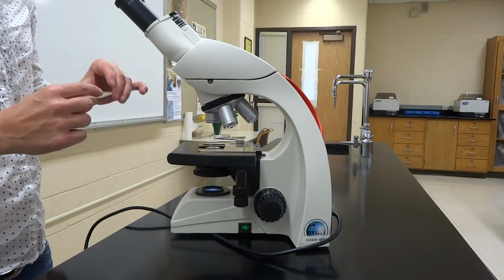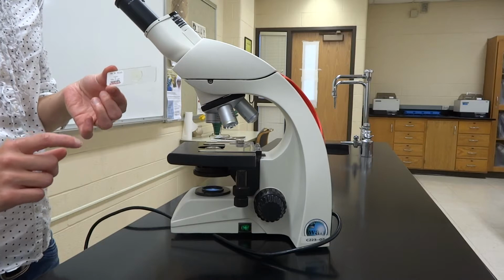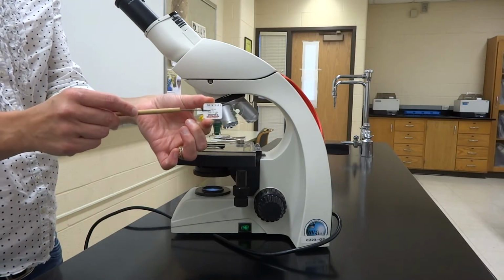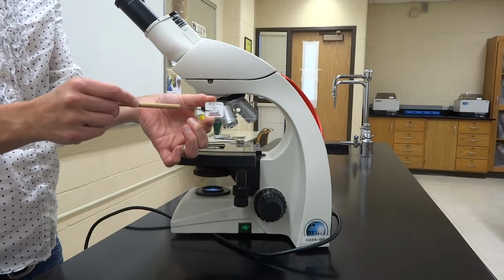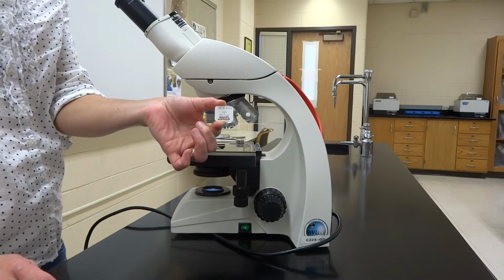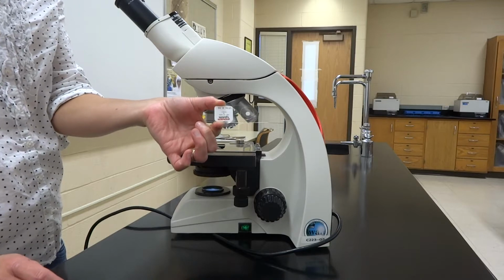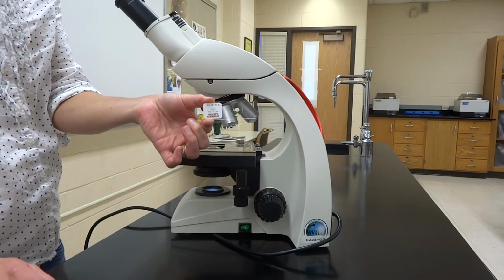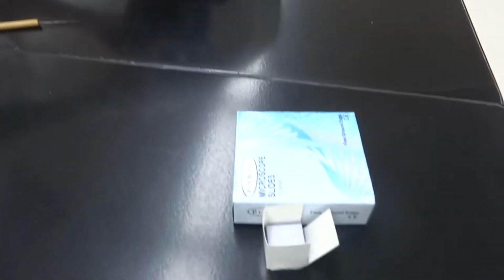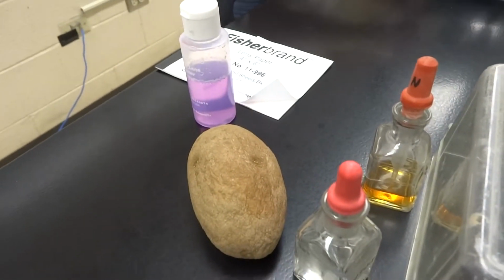Now in lab, we're going to use two different types of slides. One is a prepared slide. This one will have a label on it and will pretty much be glued in place. So these are important for us to keep. These are permanent slides. Don't throw them away. Please don't throw them away. And the other thing we will be doing is making our own slides, which we'll show you in a separate video, using slides, cover slips, and materials for lab.